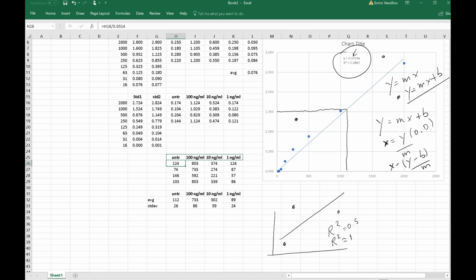All right. It is interesting, isn't it? It's not just applicable to doing an ELISA. You could use it to analyze data. You're using the machine to do the work for you.